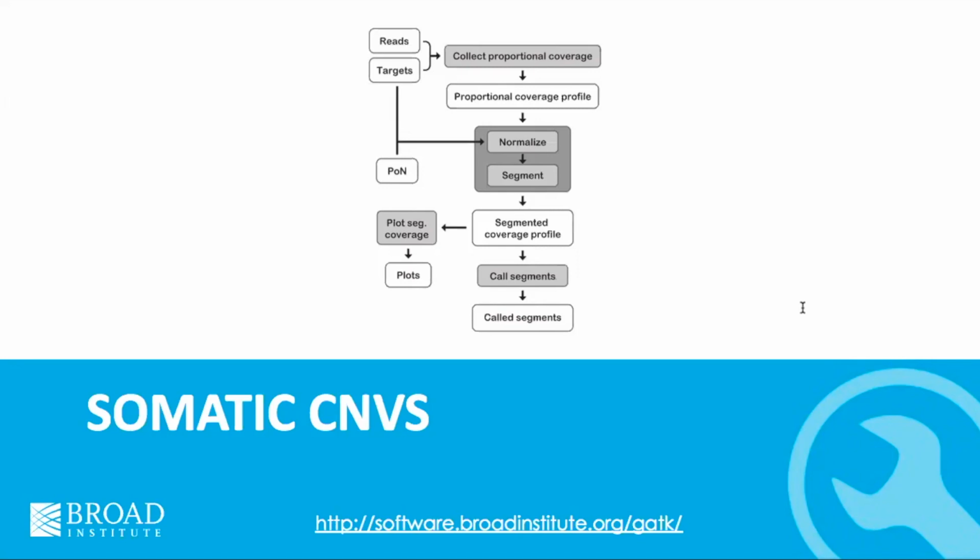But for somatic calling, that's not necessarily the case. In some cases you might have the same variants, but in many cases you have different variants that just cluster in similar genes, things like that.